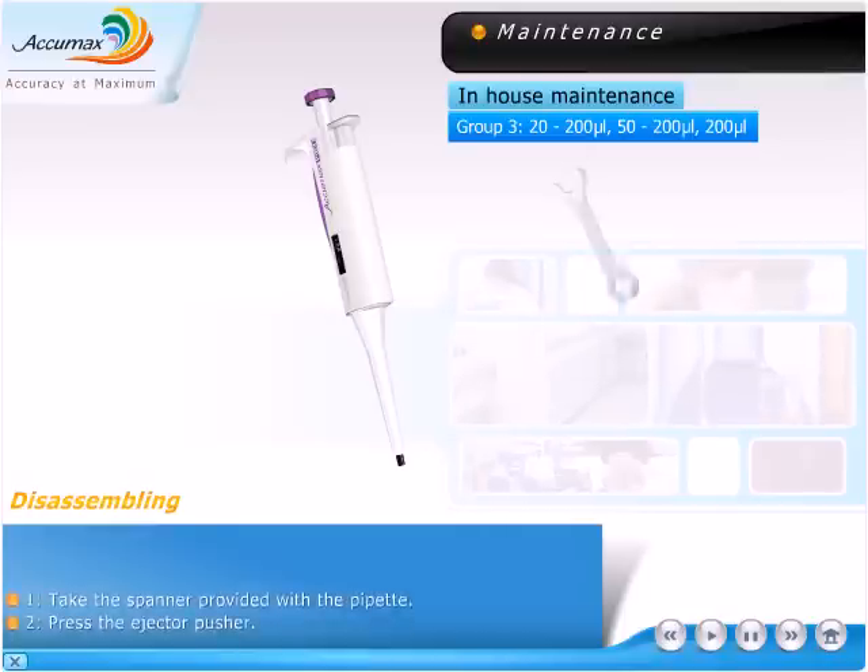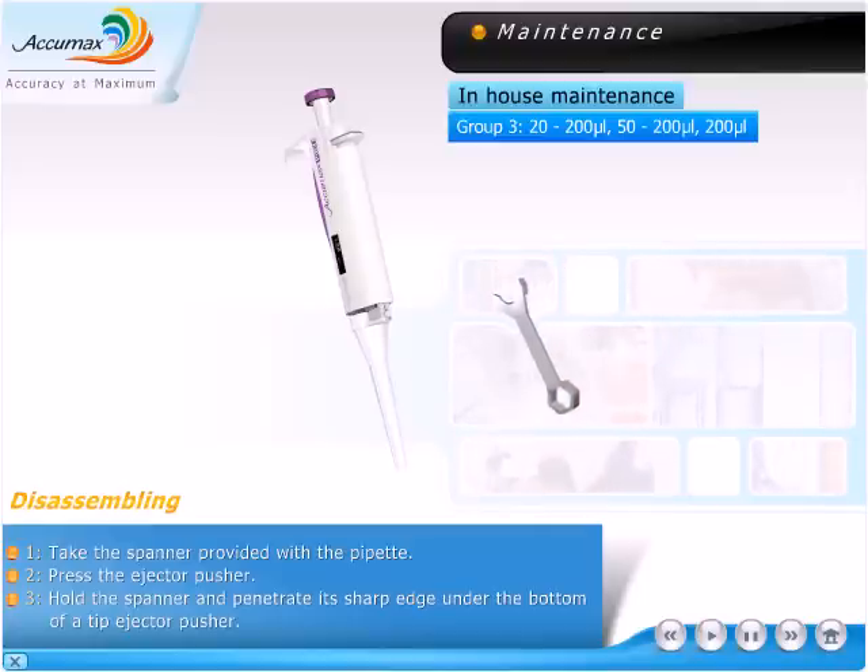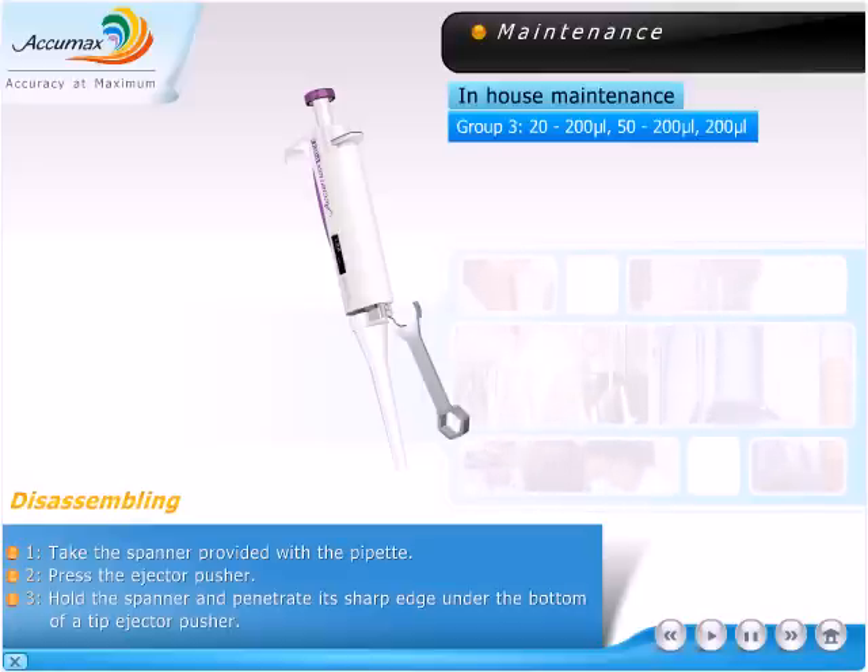Disassembling. Take the spanner provided with the pipette. Press the ejector pusher, hold the spanner, and penetrate its sharp edge under the bottom of the tip ejector pusher.